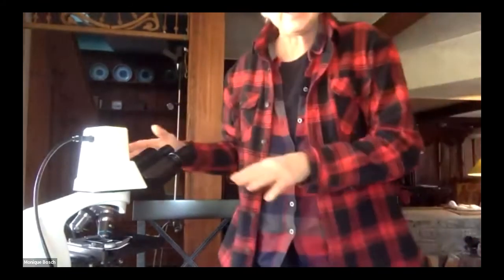Okay, so this is a microscope. It costs about $324 approximately. It's the one I recommend. And the reason I like this is that I could show you all these videos of what it looks like. There's a connector here that takes the video or photos and you put it into, I've got a MacBook Pro thing. So then you just plug it in and go to Photo Booth and it shows up there. So I'm going to do that. But first I'll show you how to prepare a slide.